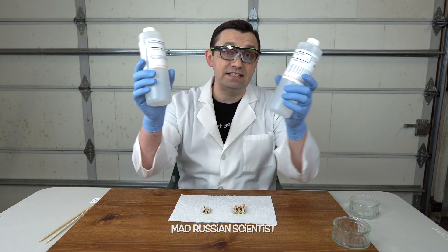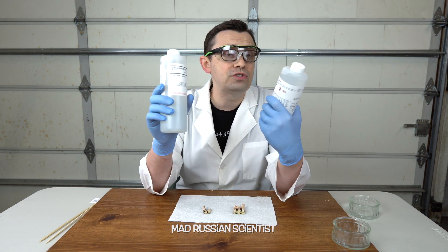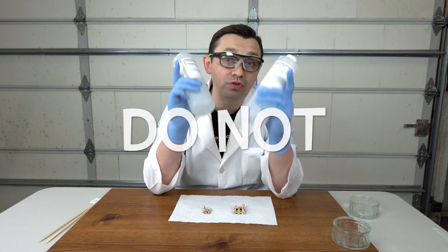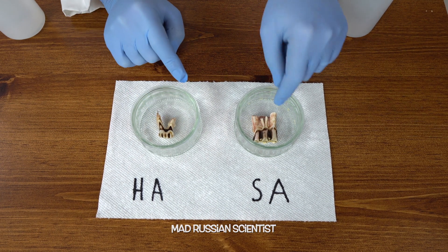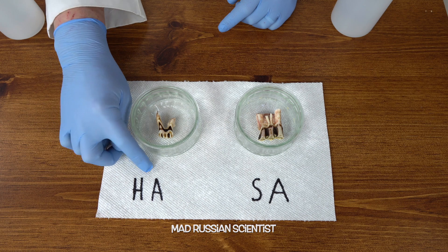My eyes are protected — these acids are very, very dangerous. I have hydrochloric acid, a two molar solution, and sulfuric acid, a one molar solution. This is extremely dangerous so don't try this at home. Here are the two teeth: one is a little bit smaller and this one is pretty big.